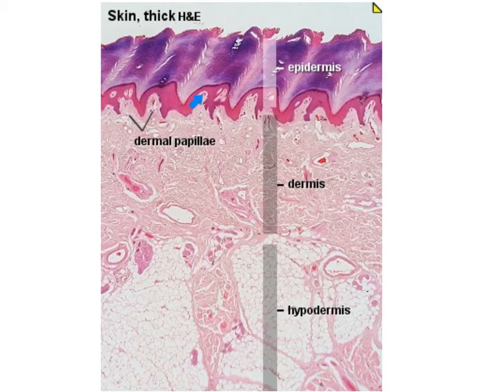We'll have the sublayer that's pushed up, and that's this area here, and that's going to be the dermal papillae. It will be in this area that we will find the receptacles for touch and pain, and those are the Meissner's corpuscles. This area right here down, we would have the reticular layer of the dermis.